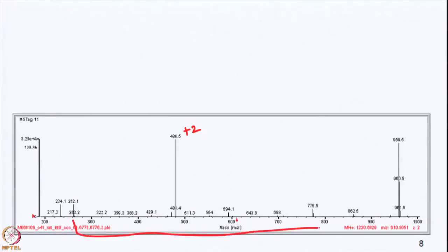That should be a BY pair, I think, right? 221, okay. And then the mass difference between these two is 28. All right, what's the ion type of the peak at 262? Okay, this was one of the things I gave you of useful information. The difference between a B ion and an A ion is 28. So we could assign that as A and that as a B ion. If this one's a B, then that has to be Y.